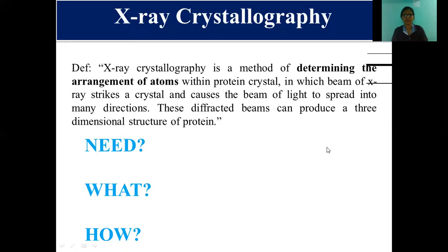So first we learn about what X-ray is, why X-ray is used, and what the advantages are of X-ray being used as a source of radiation to identify the 3D structure of protein. The first main advantage of X-ray is that it is an invisible light. It has high penetrating power. It is an electromagnetic ray. Another advantage is that the X-ray is illuminated onto the protein crystals.